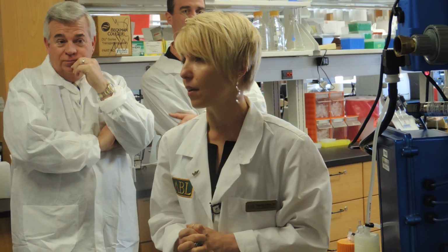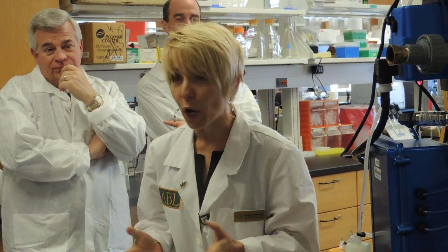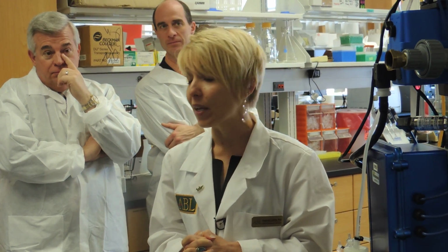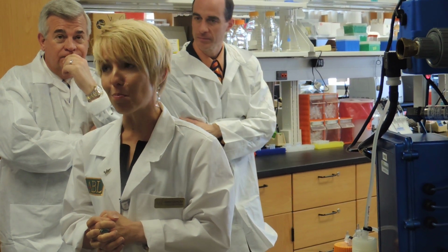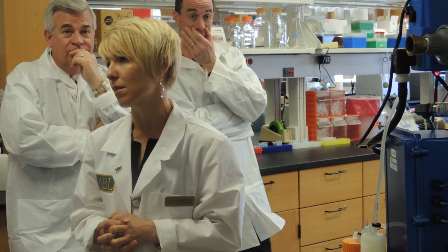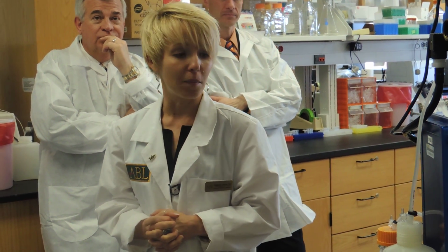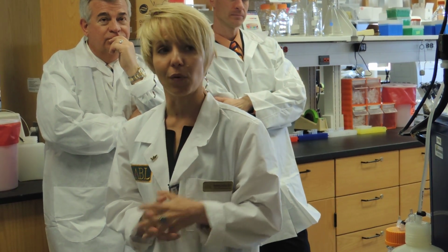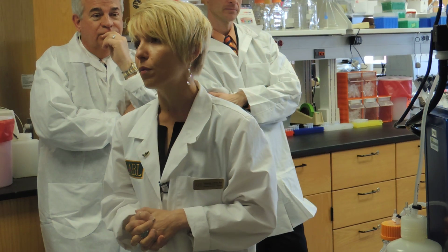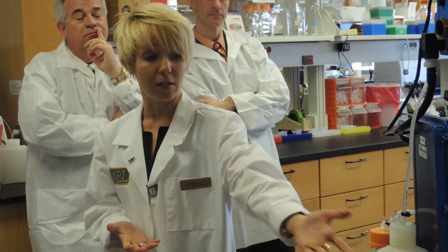So there may have been some pictures, if you were interested, somewhere else in the lab where you can actually see the difference in the color from a beach water, from drinking water, river waters, the cooling towers. There's a marked color difference. The turbidities are increased by several hundred, if not thousands of fold. But we have done a lot of work also in the sample processing arena for the detection portion. We've done everything from culture to PCR and proteomics on samples.